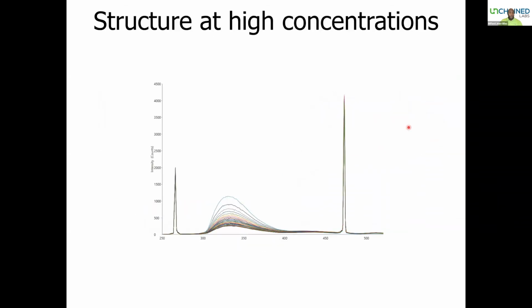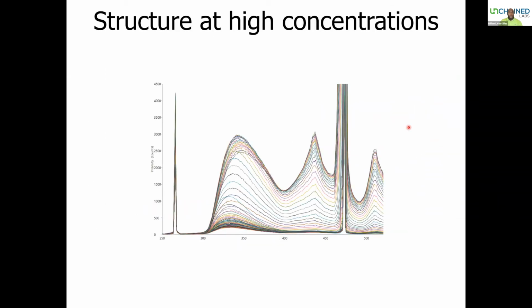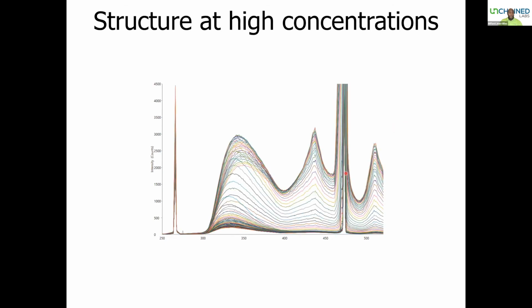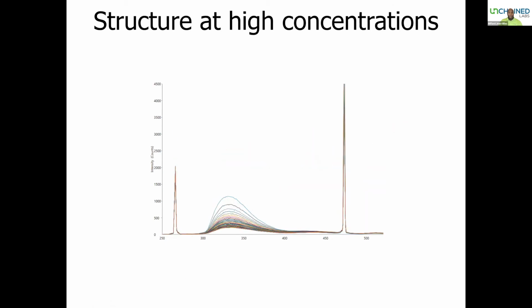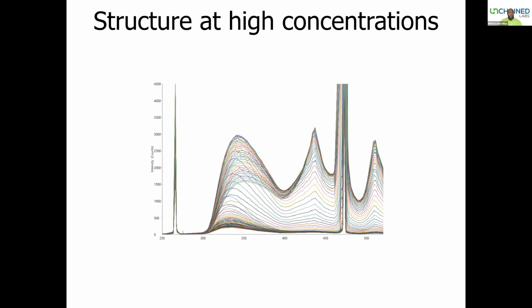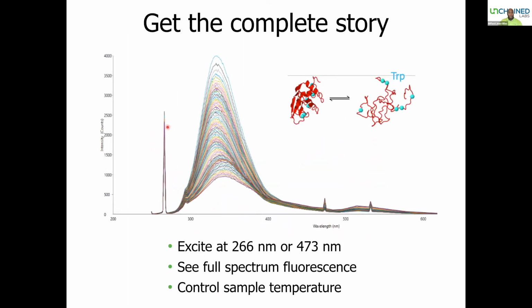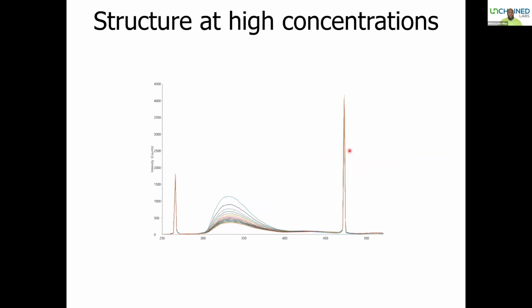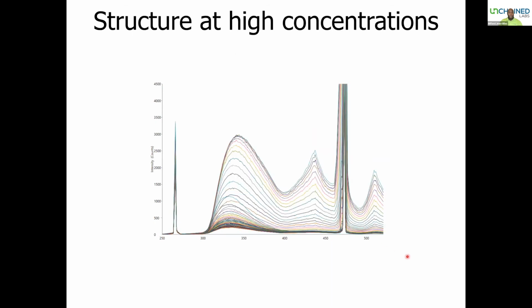And so if you now want to look at structure more carefully, here's exactly what you see if you look at the raw data, right? If you recall, momentarily I showed you a rather ideal depiction of a low concentration sample, which looked like this, and we saw a pretty orderly way of unfolding your sample. And then as we make it to a higher concentration, we see that things can look quite different here, okay?